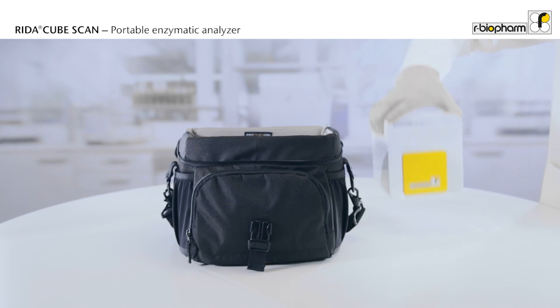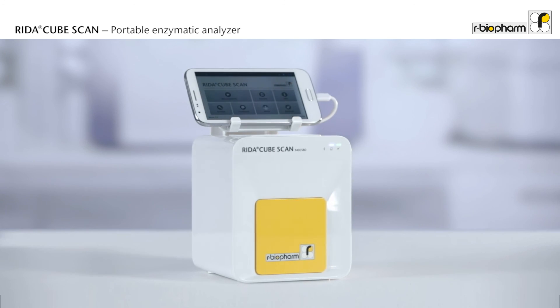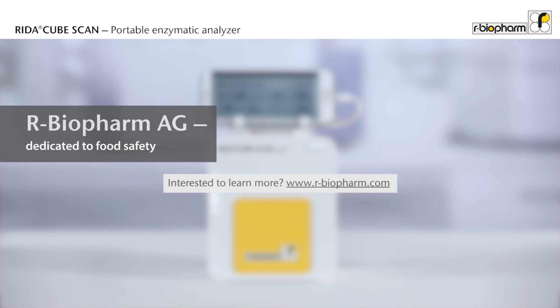And because the RIDAR CubeScan is small and lightweight, it can be easily transported in a camera bag. Perform your test wherever and whenever you want. RIDAR CubeScan: Small in size. Big in performance.